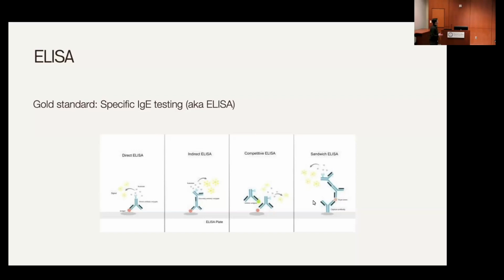If you have the direct method, the only step prior to that was what it's binding to, the antigen. In the indirect method, if the last step was the enzyme-linked antibody, we know that because it's looking to detect antibodies, the second step must be another kind of antibody. And in the sandwich method, the antigen is literally sandwiched by the enzyme-linked antibody.